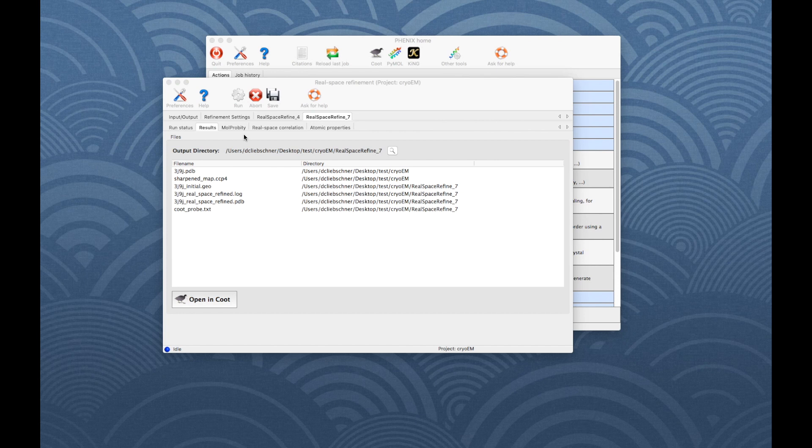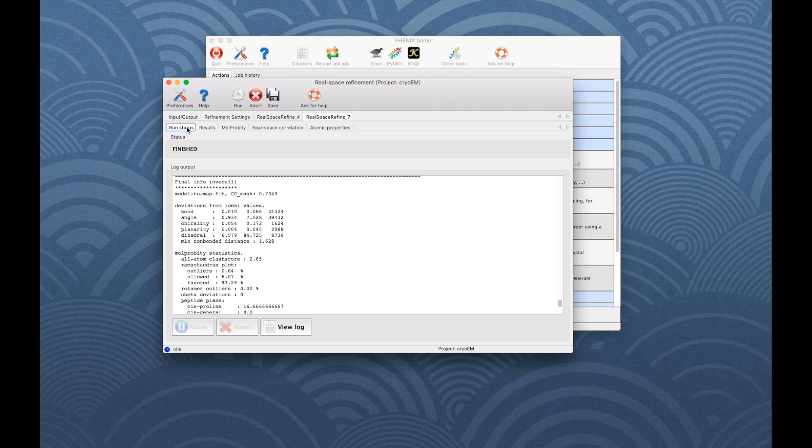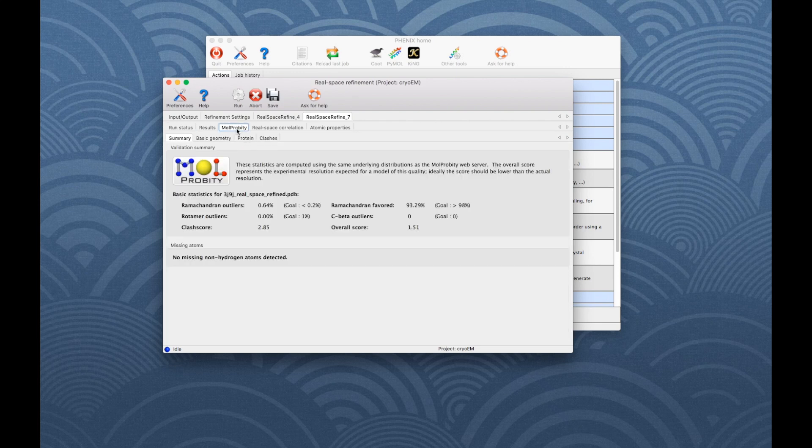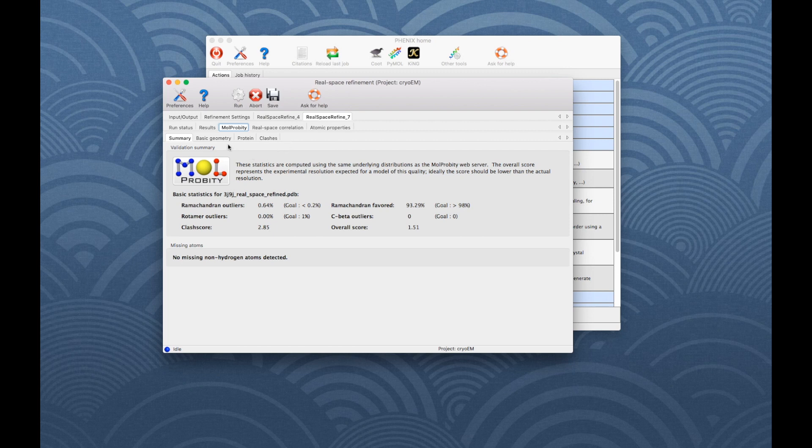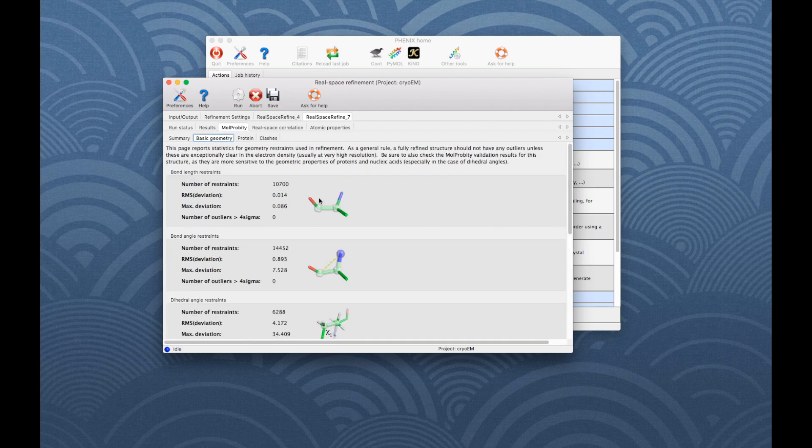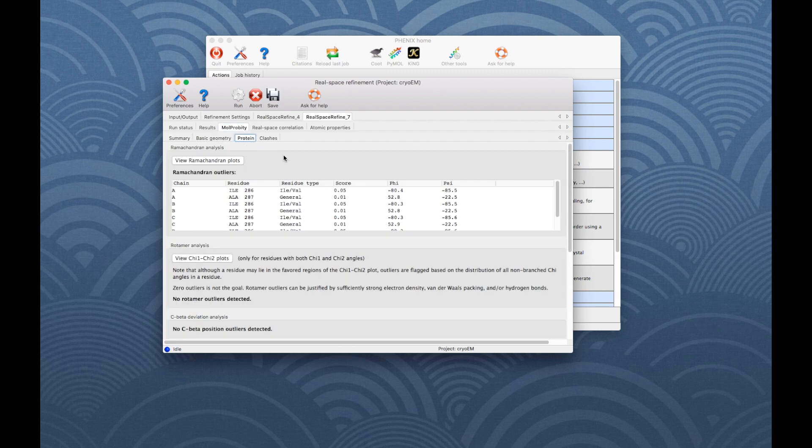Once the job is complete, additional tabs will appear reporting the output files, final statistics and the results from the MolProbity validation analysis. It is important to go through all the validation criteria and to make sure to address all reported problems.